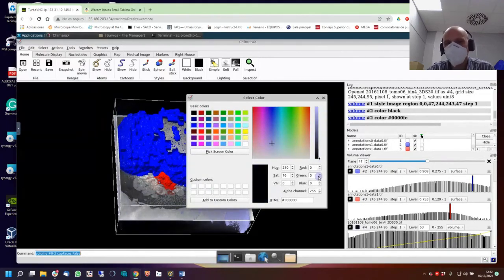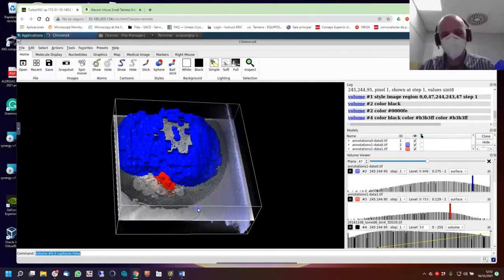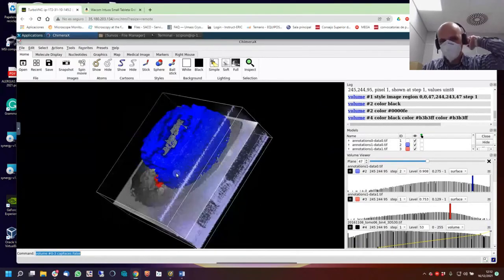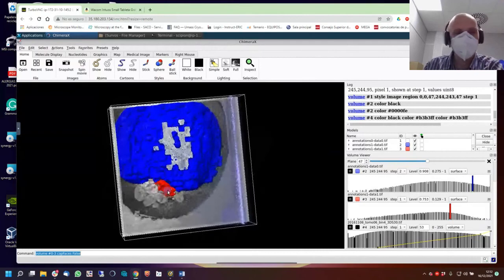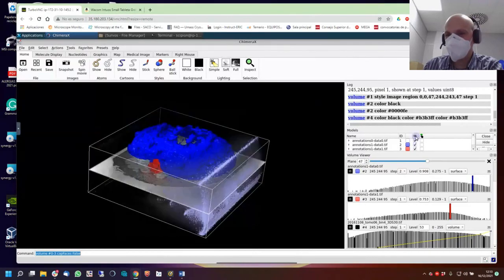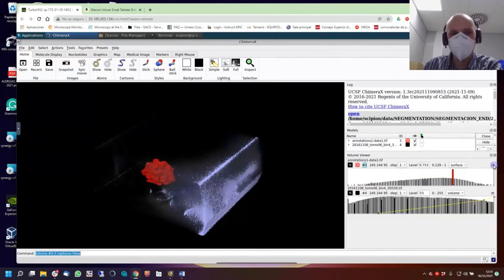Let's start from the very beginning. We can start from the very beginning. At some point, I got totally lost and super confused, sorry. Don't worry. We can start from the very beginning. I have one lavender box and one turquoise box. Don't worry. Close again. Everything. Doesn't matter. Click, click, click, click. We are here to show how to do that.